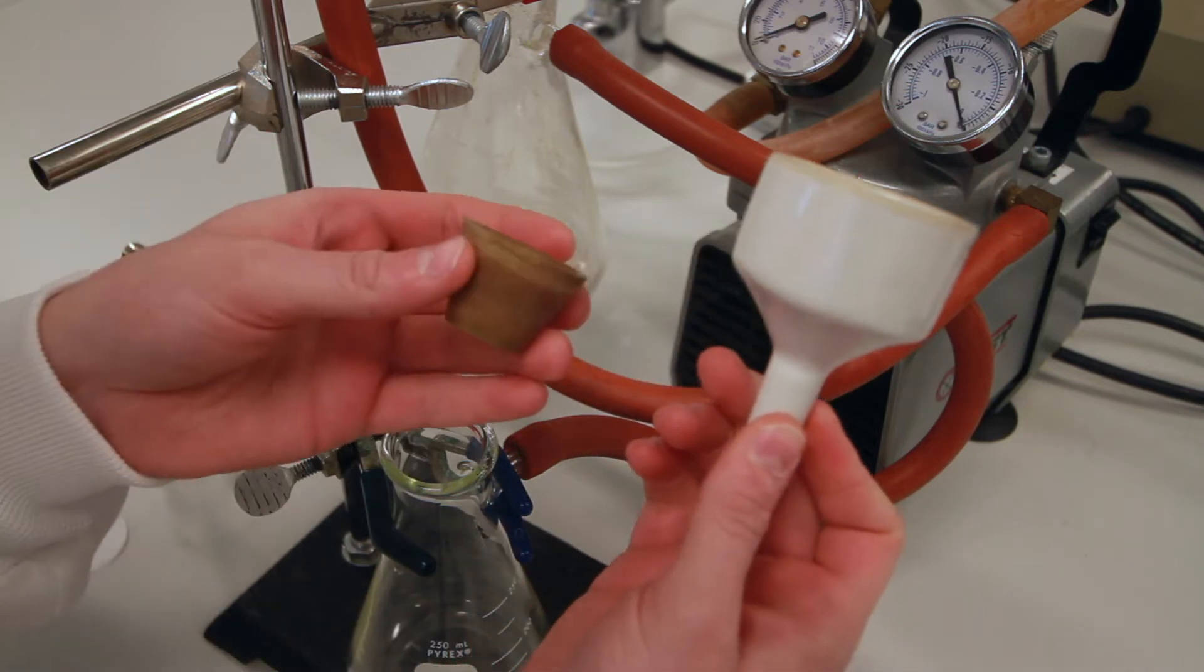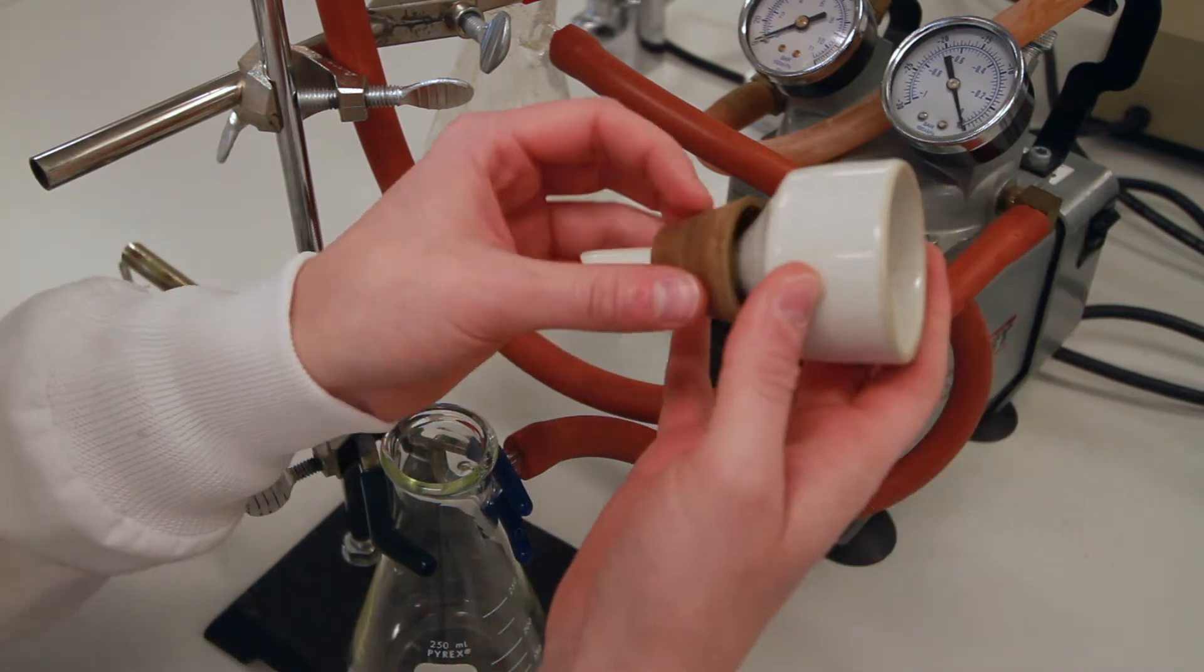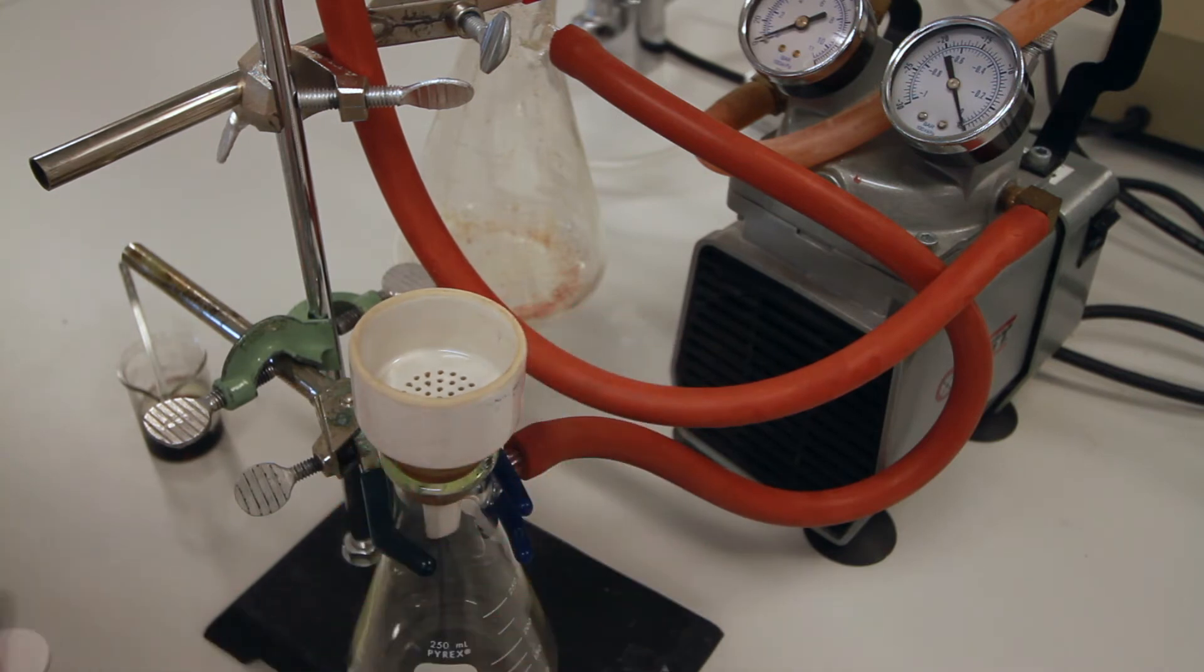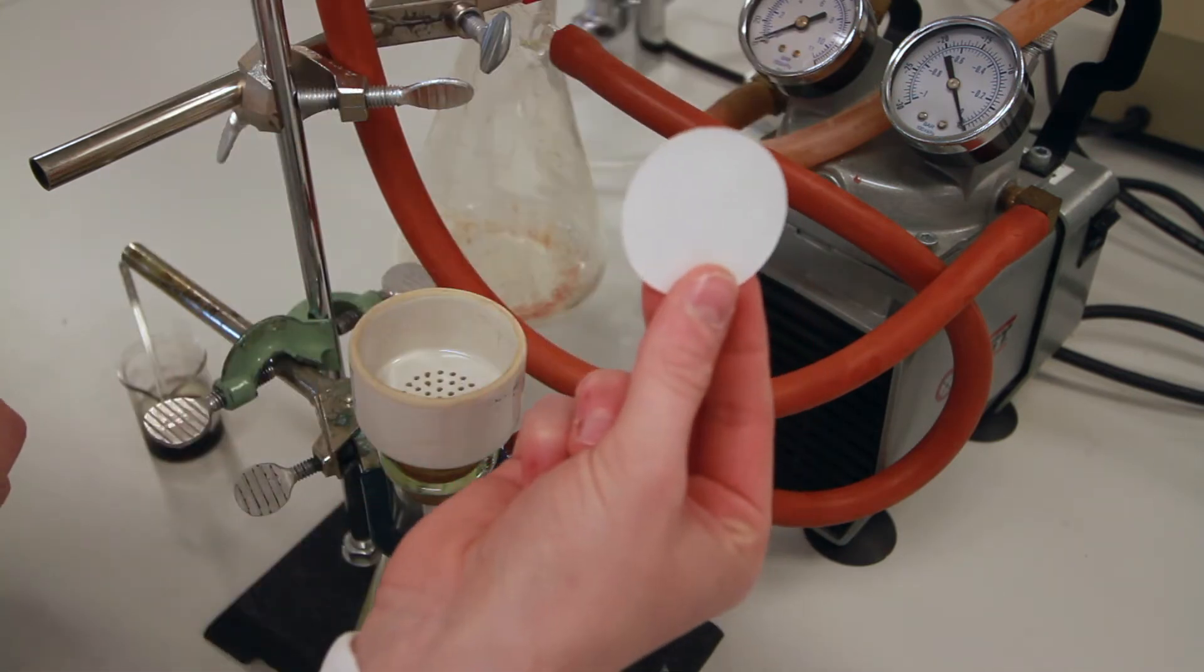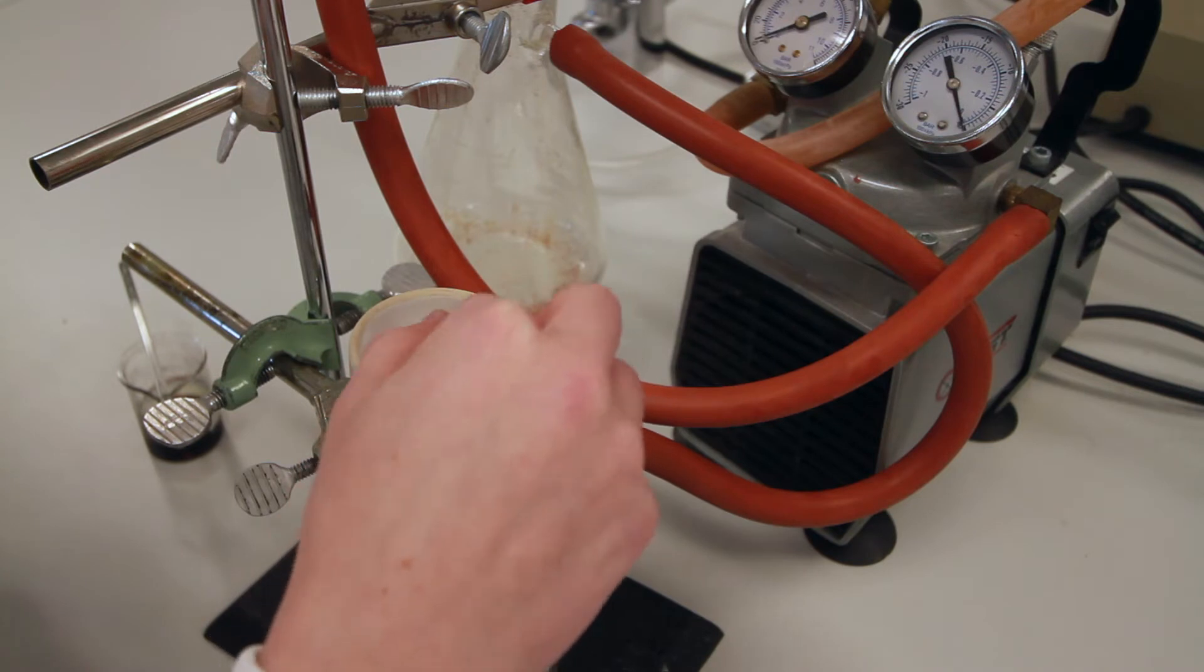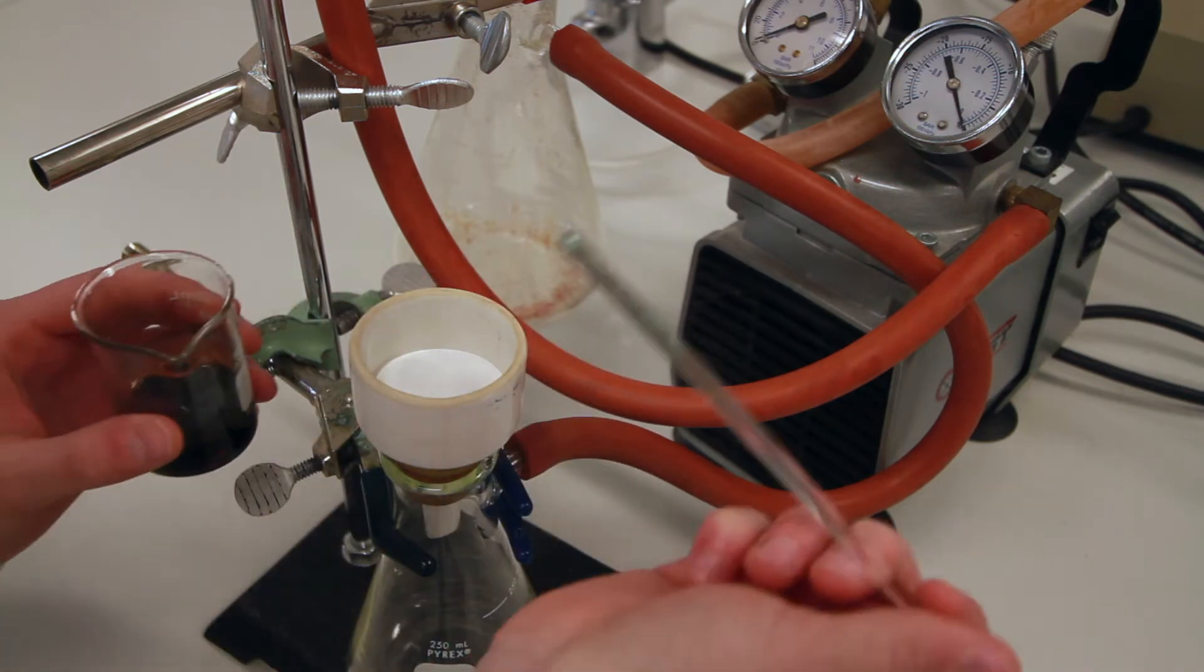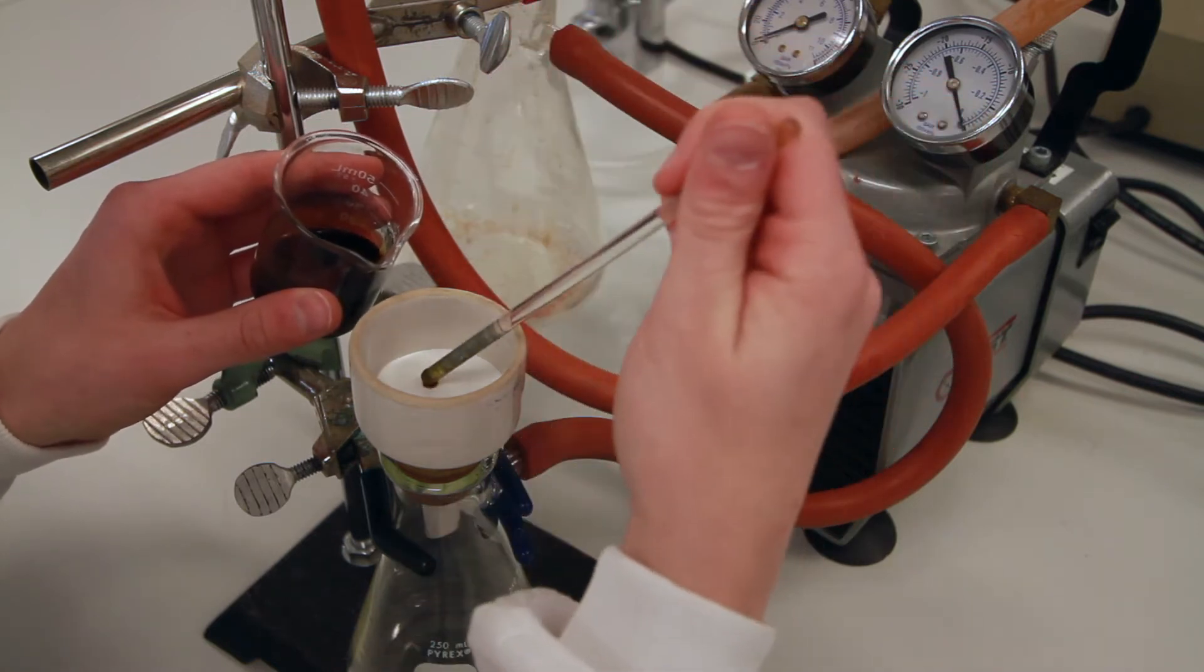Obtain your Buchner funnel and the rubber adapter and place it into the filter flask. Obtain a piece of filter paper and place it into the filter. Begin by wetting your filter paper with the solution you're about to filter.